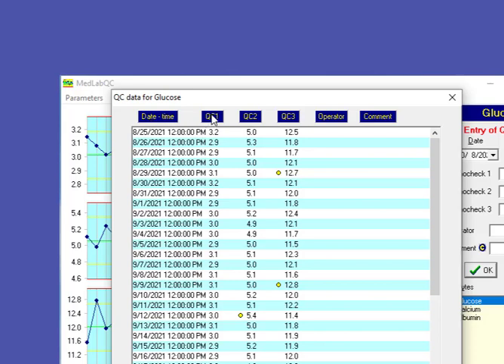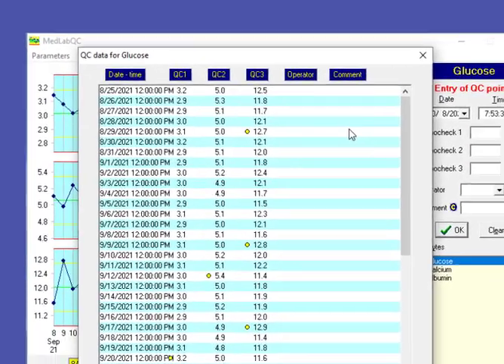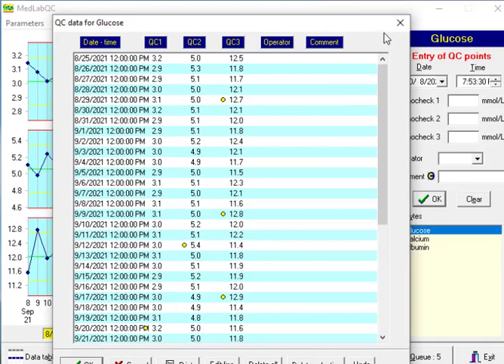In our column we have different control levels. The name of operator will be shown here and of course we have comment for some situations that there is a problem in daily QC.